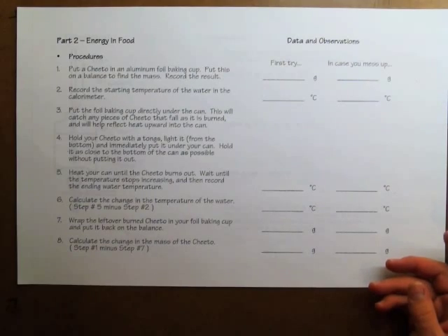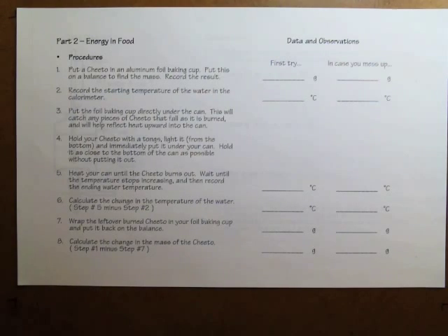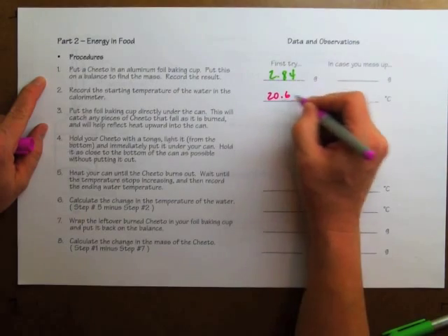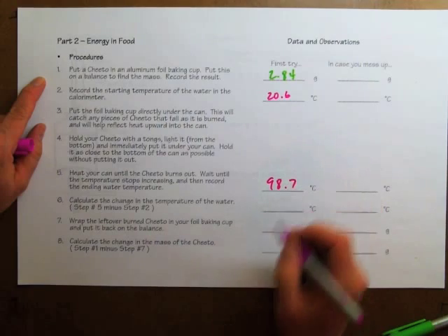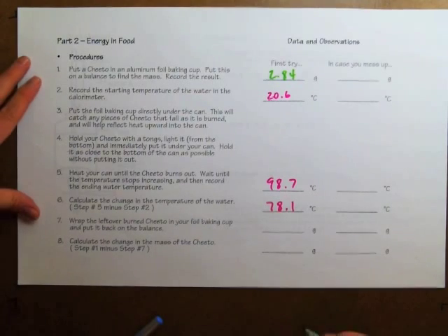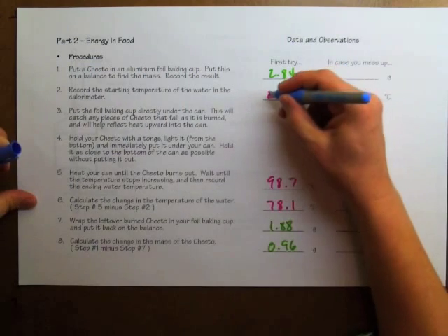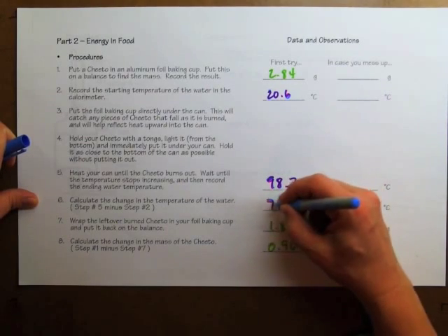In the next part of the experiment, when we burned the Cheeto, these were the data I collected. My Cheeto in the aluminum cup weighed 2.84 grams, and the starting temperature of my calorimeter was 20.6 degrees Celsius. I burned the Cheeto and the temperature went up to 98.7 degrees for a temperature change of 78.1 degrees Celsius. When I re-weighed my Cheeto, it only weighed 1.88 grams because 0.96 grams of that material were burned away.